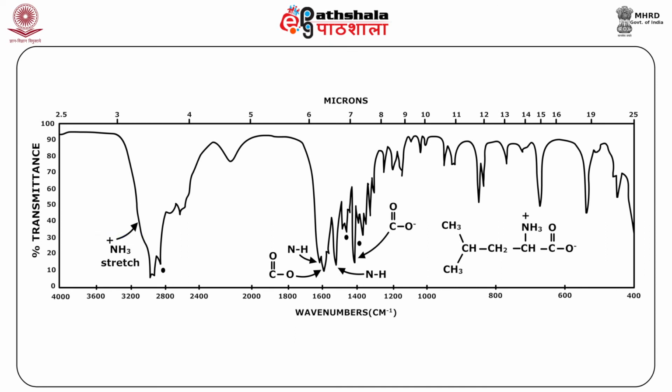The ammonium ion absorbs to the extreme left in this region, while the tertiary amine salt absorbs to the extreme right. Primary and secondary amine salts absorb in the middle of the range, between 3100 and 2700 cm⁻¹. The bending NH vibrations, which are again strong, occur at 1600 to 1500 cm⁻¹.